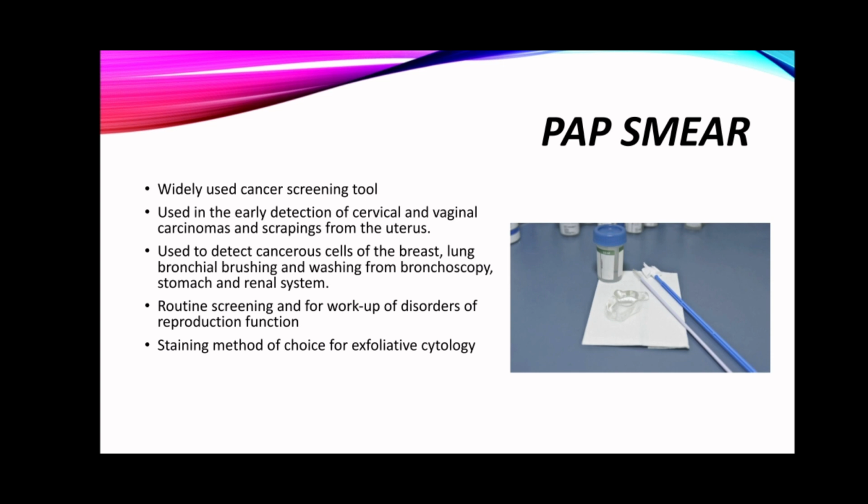It is also indicated, class, that Pap smear is a routine screening technique and for the workup of disorders of reproductive function. This Pap smear technique is the most widely used cancer screening tool and is a cytologic examination of desquamated epithelial tissue to differentiate normal from anaplastic cells.